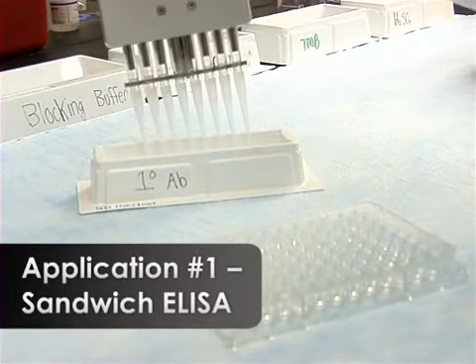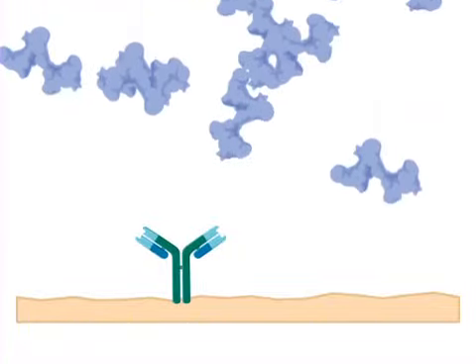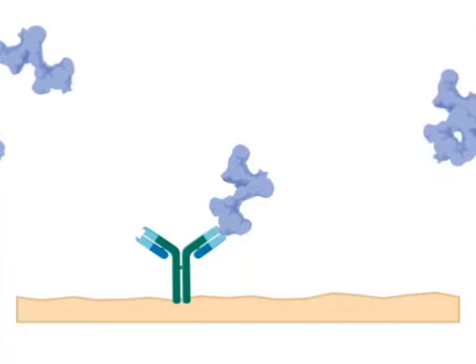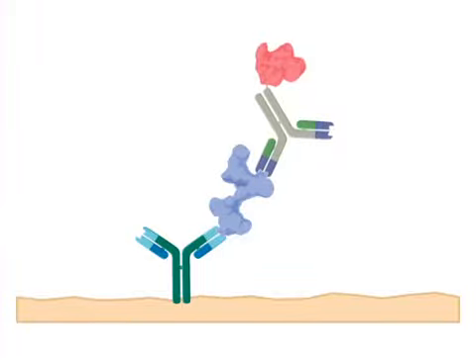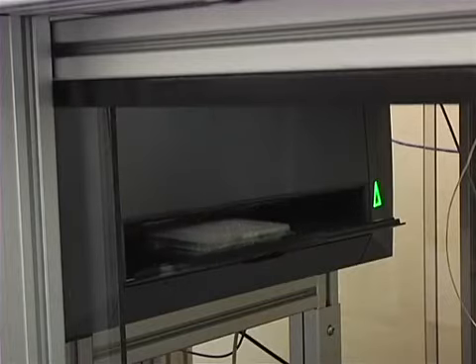Probably the most common type of ELISA performed is the sandwich ELISA. In a sandwich ELISA, a 96-well plate is coated first with a primary antibody that recognizes the target protein of interest. After washing away the excess sample with PBS, an enzyme-linked secondary antibody is added, followed by a colorimetric substrate. The absorbance is then measured in the same way as for a typical ELISA.